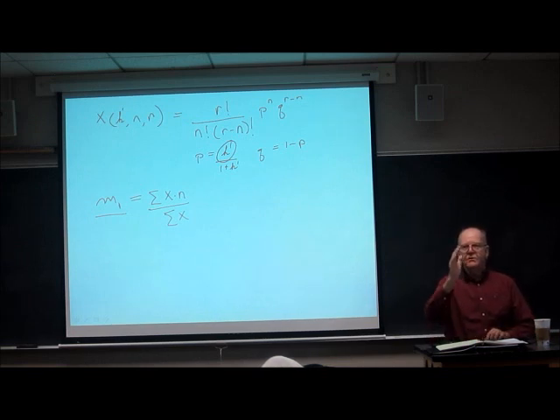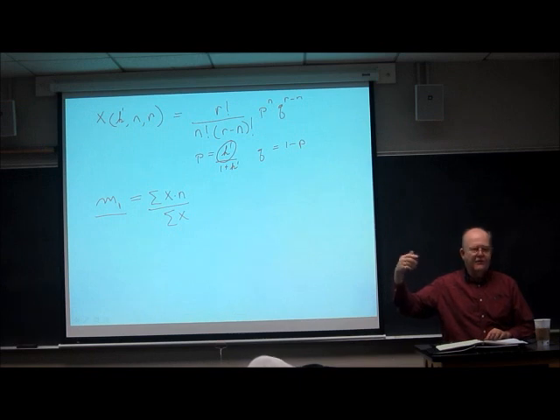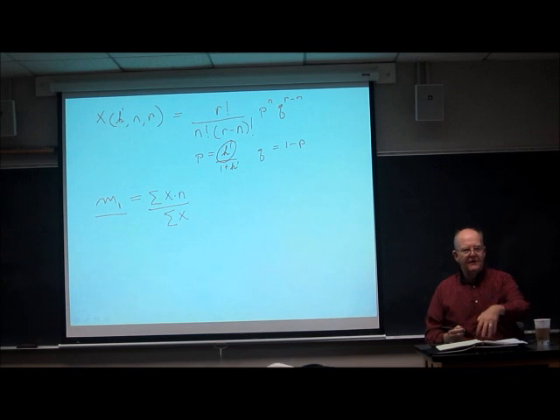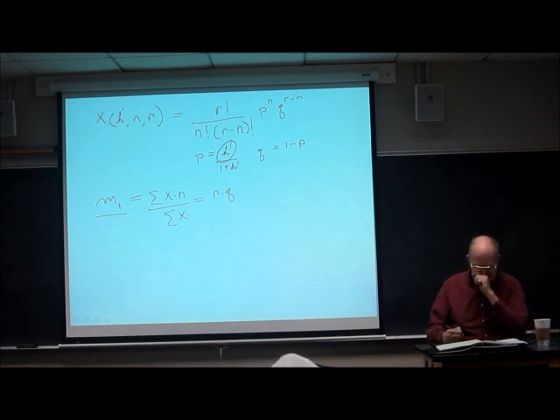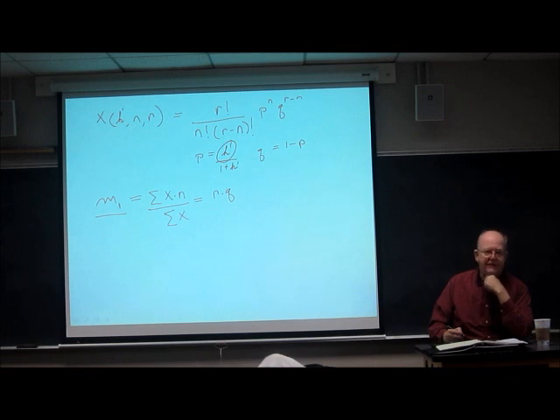And that center of mass moves through the set of tubes as we do more and more transfers. So if we take this binomial expansion function, put it in here for x, and then do the summation over all the tubes, that will work out to be r times q, where q is the fraction in the upper phase, and r is the number of transfers.